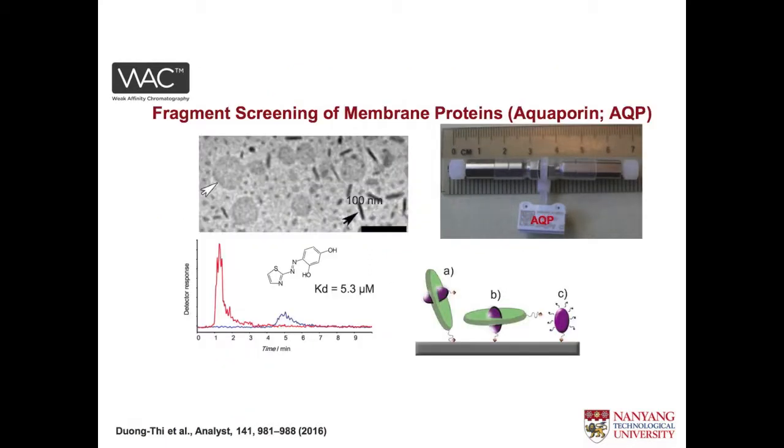All right, another thing we have been trying, and this is a big challenge for us because it's a big market, is membrane proteins. According to statistics, membrane proteins are more than 50% of all targets. So we did a study in Uppsala with Professor Katarina Edwards, where we tried to work with membrane proteins integrated in a lipid environment, and see if we can handle that with WAC.